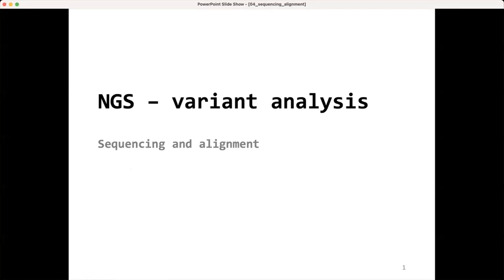This presentation will be all about preparation of your alignment for variant analysis. That's actually a very substantial and important part, because the choices you make during the alignment and preparation of the alignment can have a big effect on your variant analysis itself. That's why we spend quite a bit of time on it.